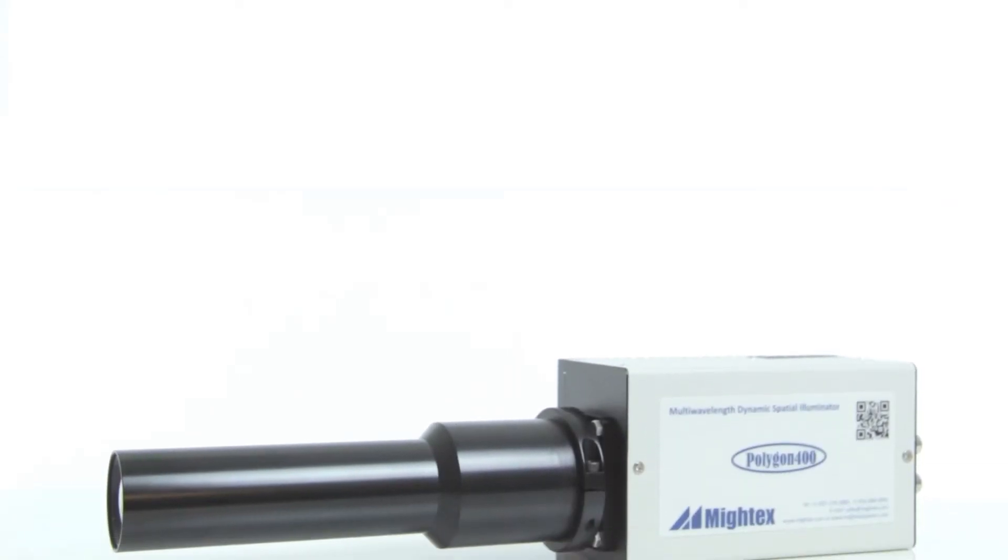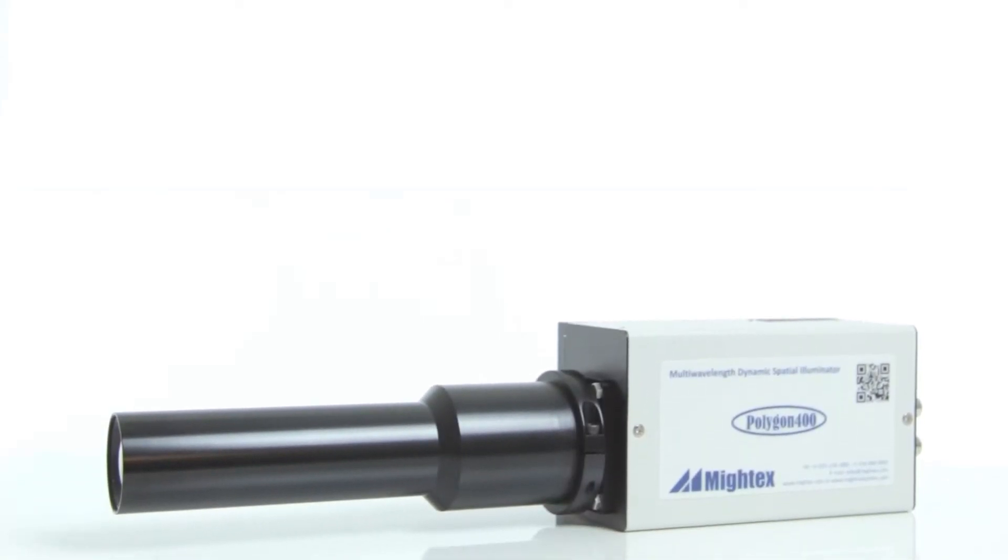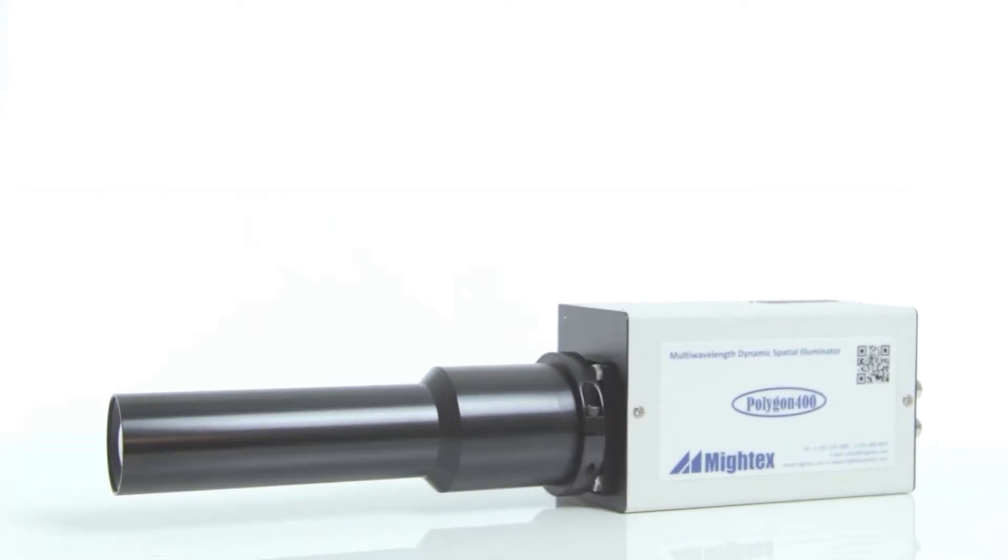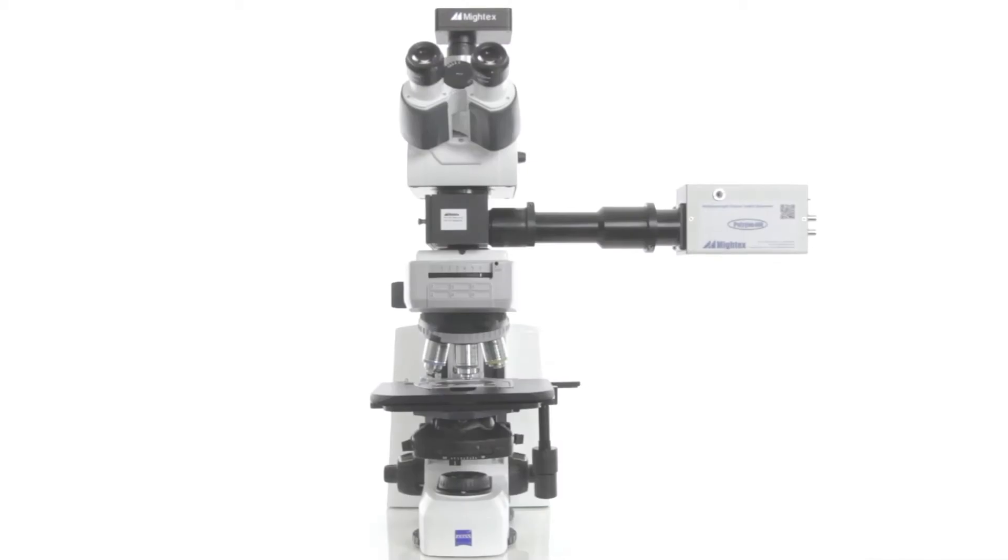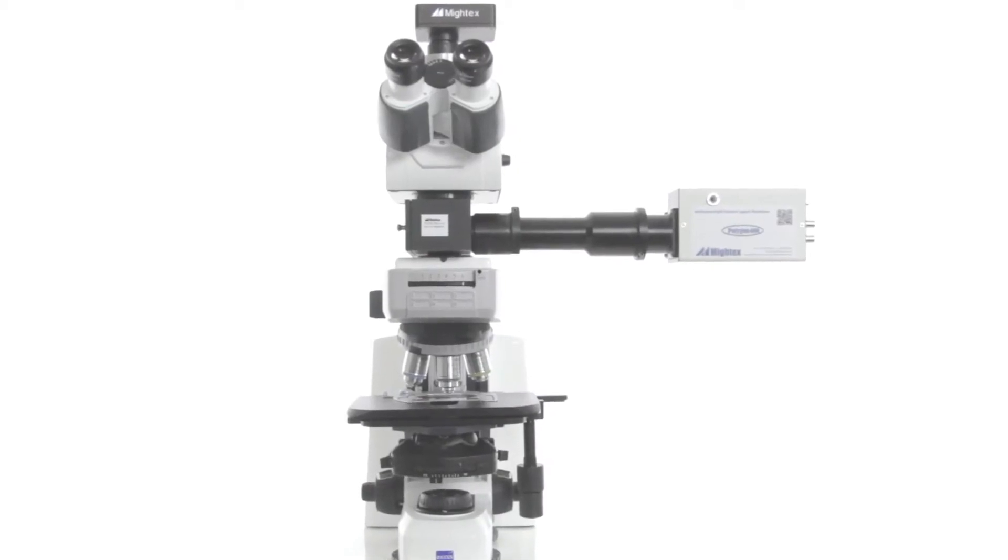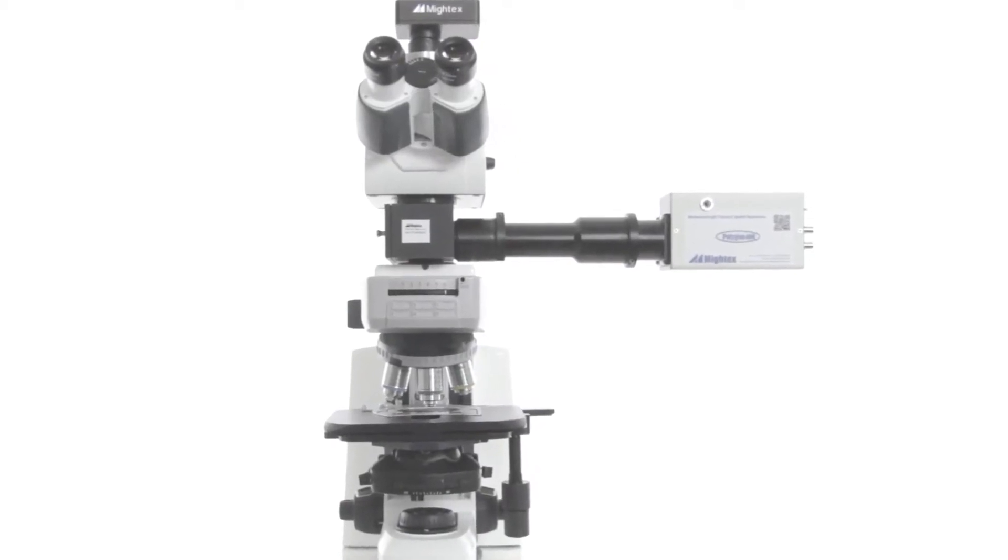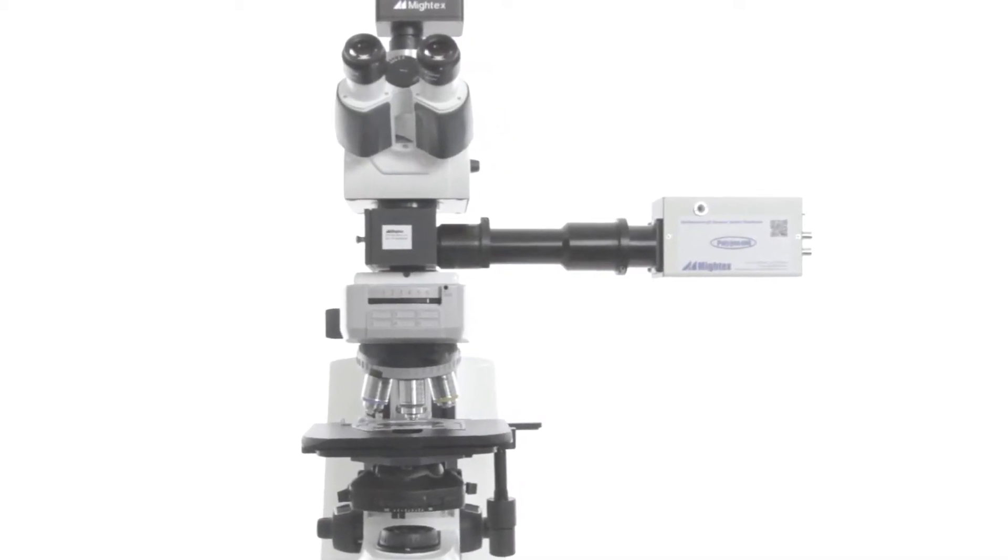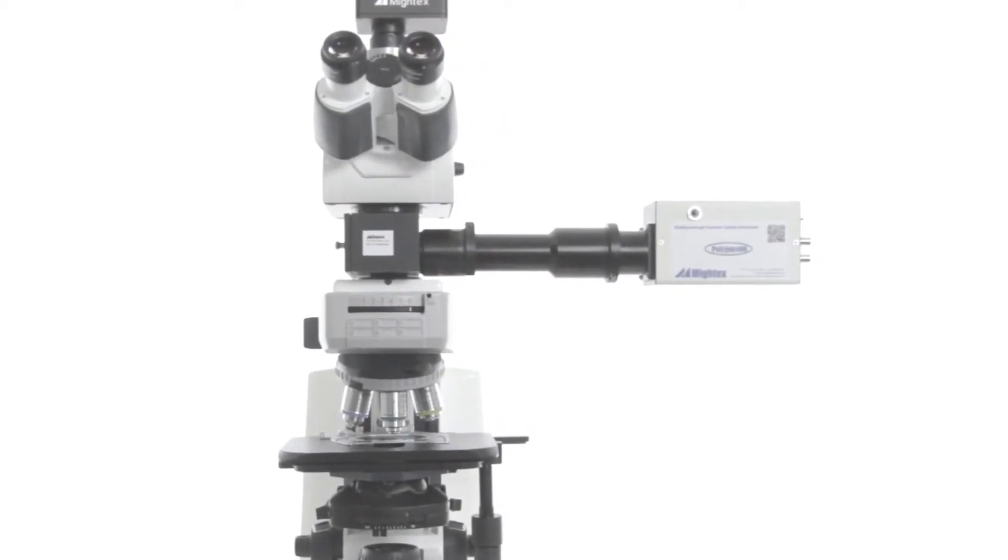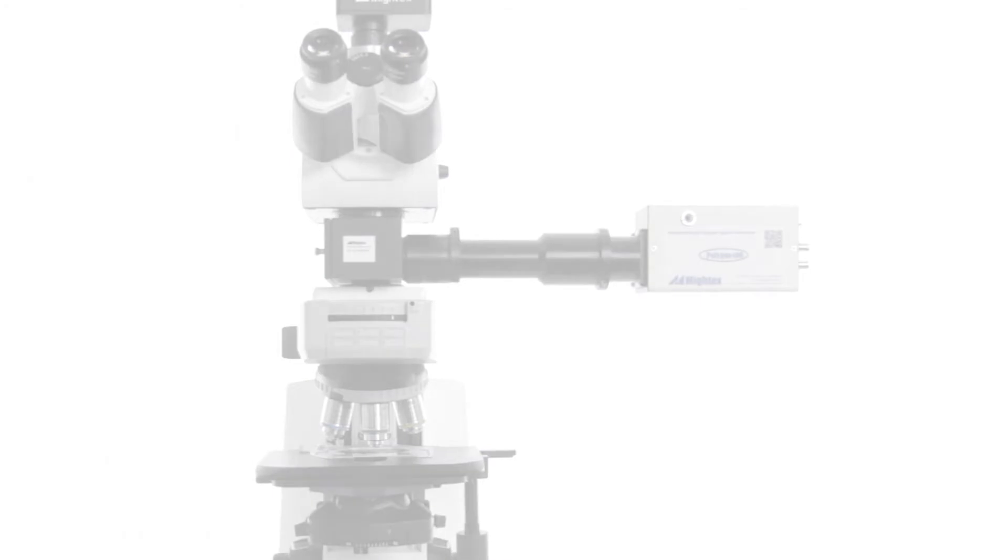Mightex's Polygon 400 has captured the attention of bioscience researchers across the world for its ability to target light onto any cell or region of interest with incredible accuracy.